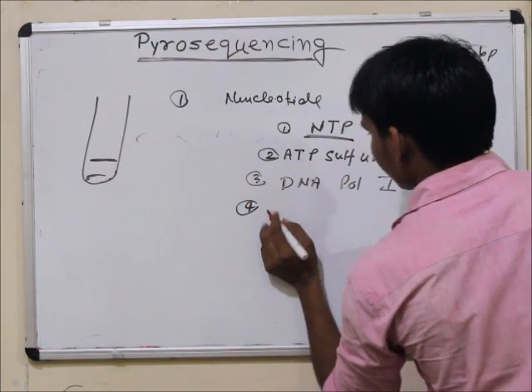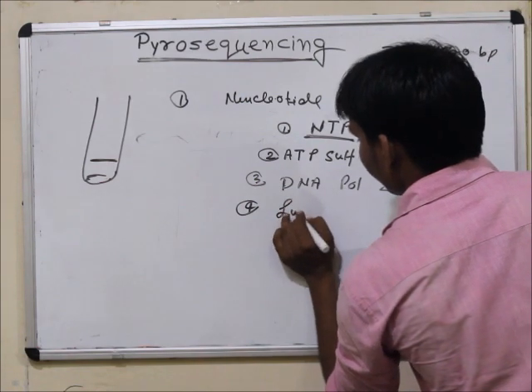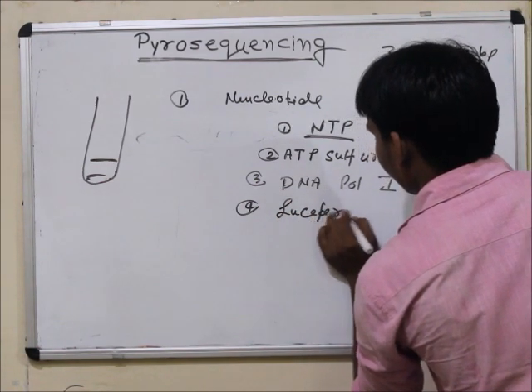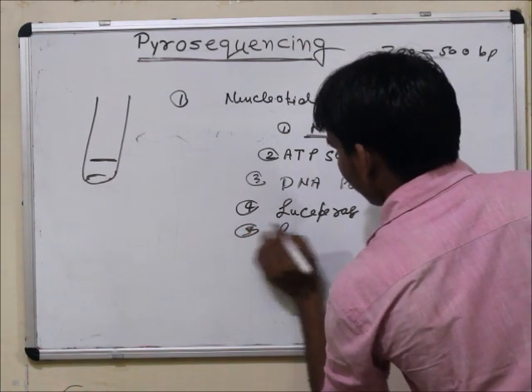Fourth is luciferase. Fifth is luciferin.